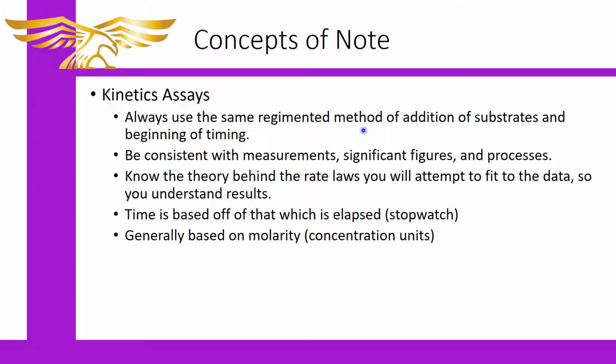So it can be good sometimes for you to work with another person if there's not enough room in the specific area, or if you're having to work in the water bath, and to work together to make sure you're recording your time, since everybody can't always have their cell phone at the same time right in the same place. Most people use the stopwatch functions on their cell phones now. You don't have to. You can use a regular watch and simply record the time. However method is best for you. Just remember that you're looking at the elapsed time the reaction occurs, not necessarily this hour versus that hour. It's the difference between the start and end time, the total time that you need.